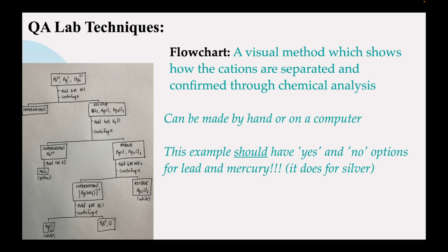Now you'll be creating a flowchart for this lab. It's not difficult. Hand-drawn versions are fantastic. If you want to go fancy on the computer, that's great too, but honestly, just a hand-drawn one is fine. But it'll look something like this, all right?